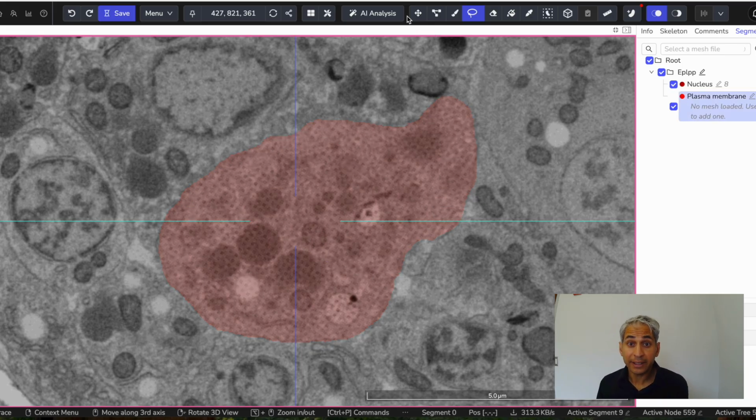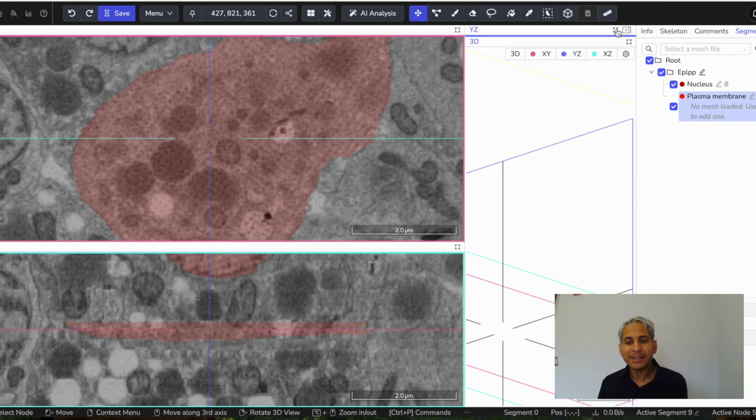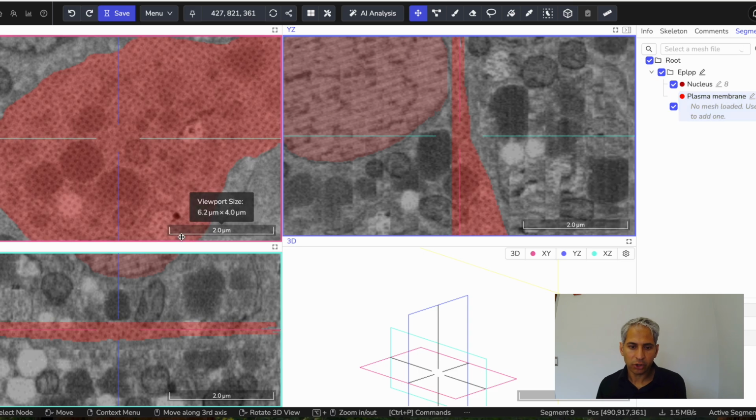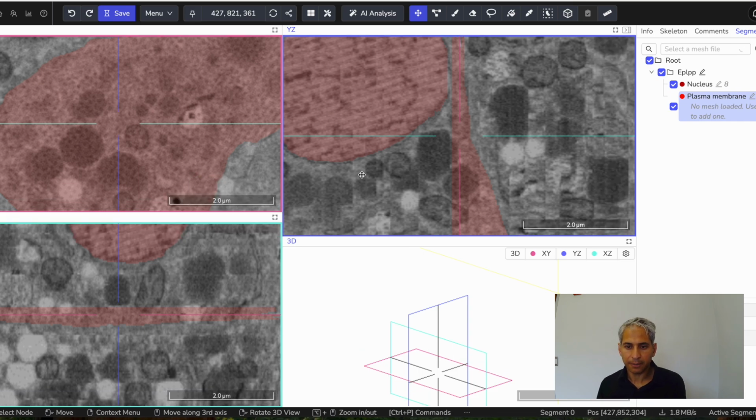That's enough. This is addictive, actually, in my case. So I'm going to stop here. And then I want to see what I did. So let's see. Normally, if you were to minimize this panel, you would get 4 panels, unless you manually resize them.